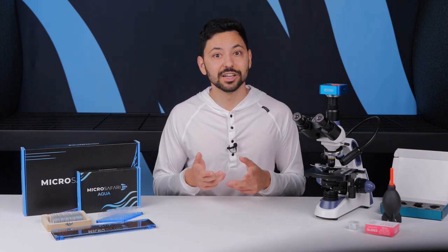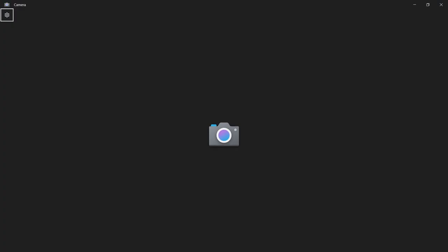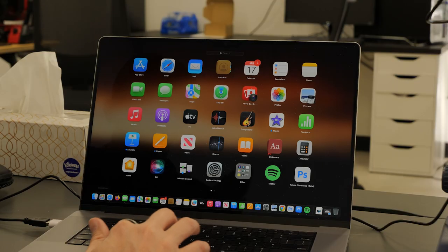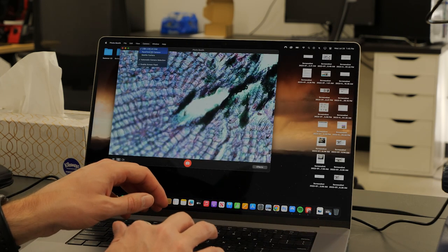You can also use the camera via USB mode. Just connect to your computer with a USB cable and use it like a webcam. You don't need to install the software that's included in the CD-ROM in the box. On Windows you can open up the camera app and on Mac you open up the photo booth app. You may need to switch cameras if you already have a webcam integrated into your computer.